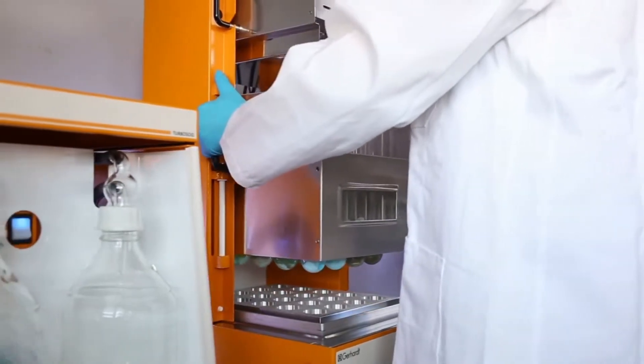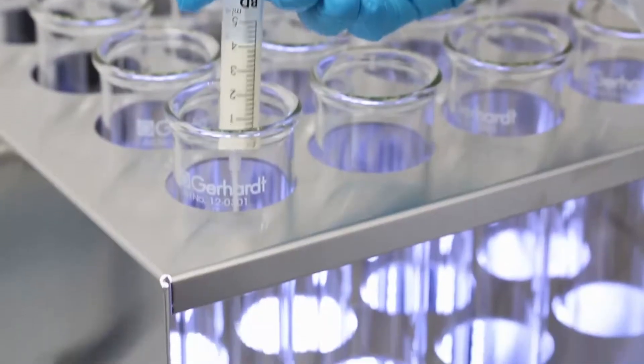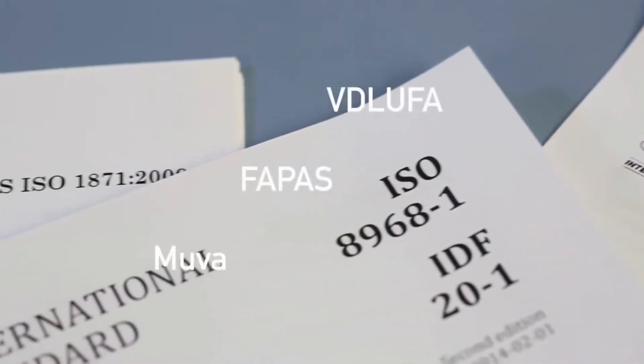To achieve this, we always use innovative technology. Successful ring tests underscore the high performance of our devices.